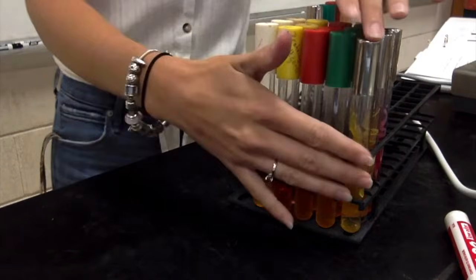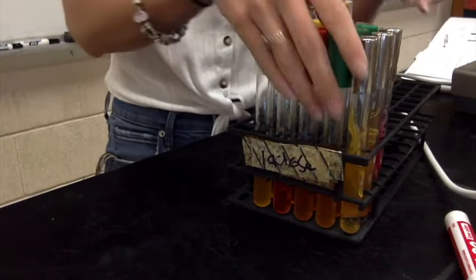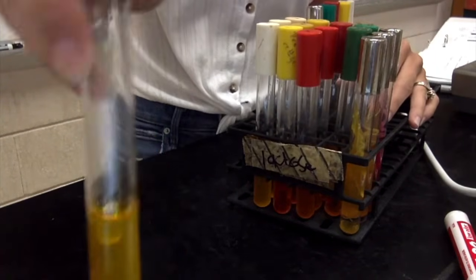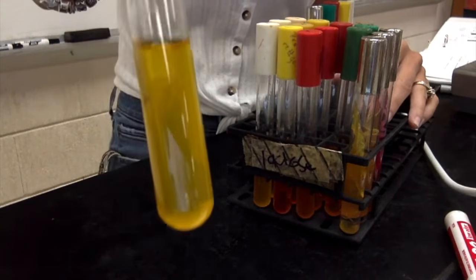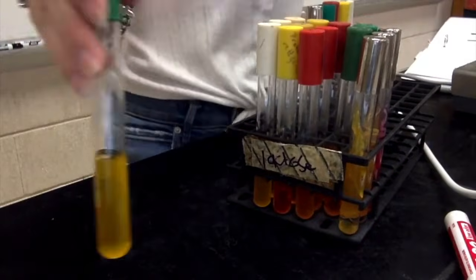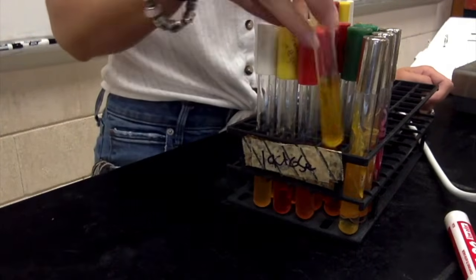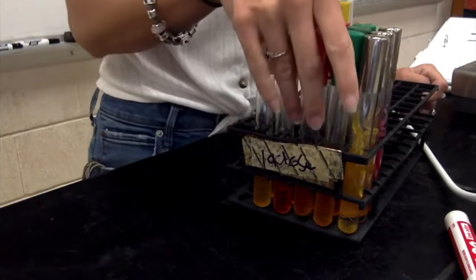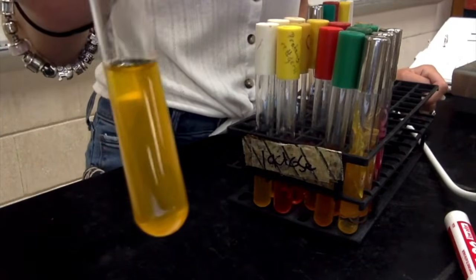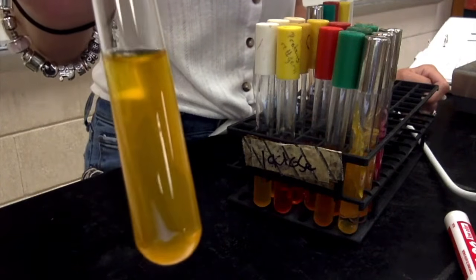So now, since we got an all yellow tube, we need to break up the sugars and see which ones it fermented. First is going to be our lactose. It's yellow, so that's positive for fermentation, and you see the gas bubble in that Durham tube. So that's a positive reaction for fermentation with gas for lactose, which we already knew E. coli was a lactose fermenter because of the selective and differential media, but we did it anyway.